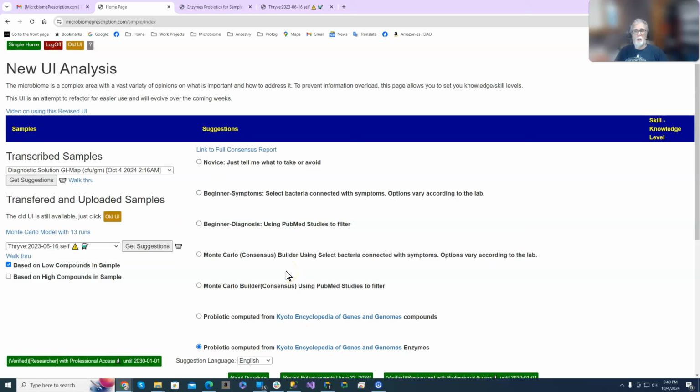We look for where everybody agrees. That's the one which is more likely to be correct. This works for some labs, but not all of them. We'll show you which ones you are a match of. Check off the ones you are matches for. Go and see what it comes up with, and go from there. And don't forget to add in your symptoms so that this becomes better and more accurate. As the number of samples goes up and the number of people with symptoms goes up, we get better ability to detect which bacteria are the likely ones.